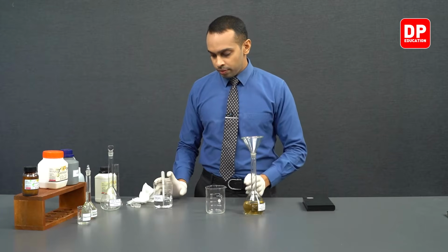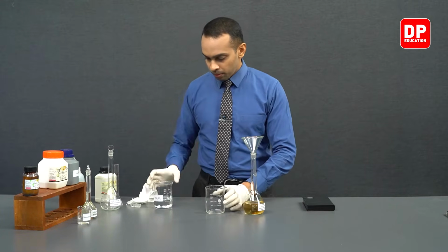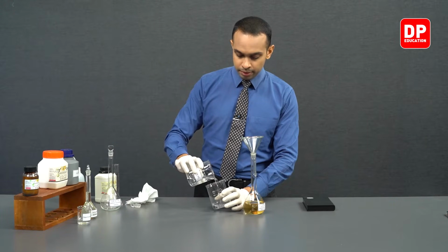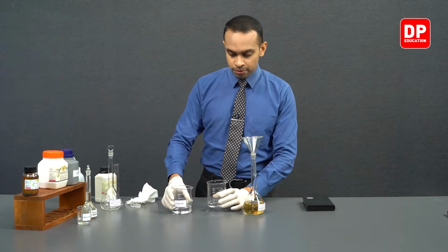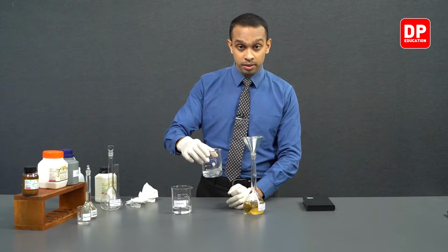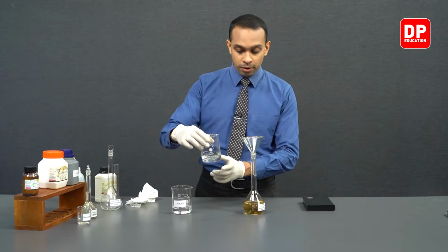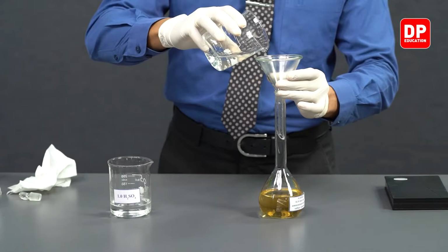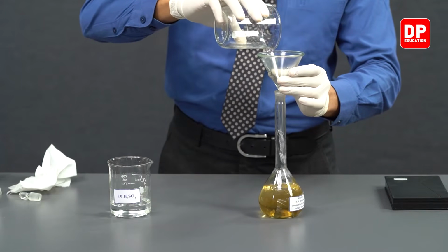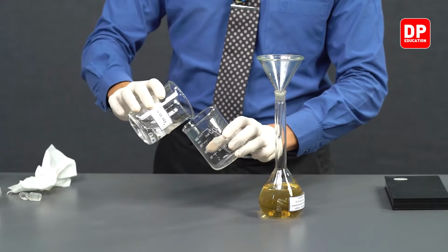Then we can wash our beaker with a little bit of sulfuric acid to make sure all of the ferric sulfate is taken from the beaker into the volumetric flask, and we can wash the funnel as well. We can carry out another washing.